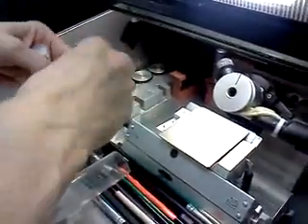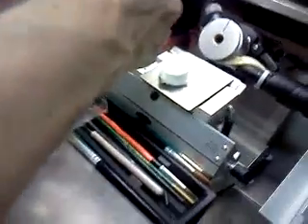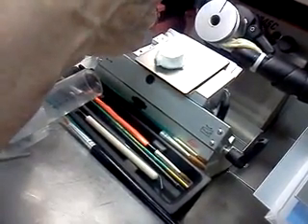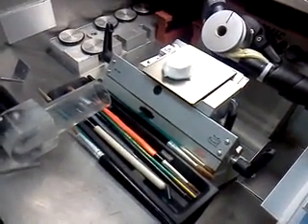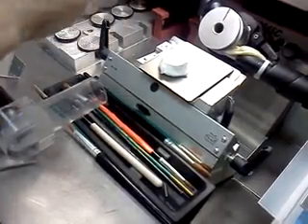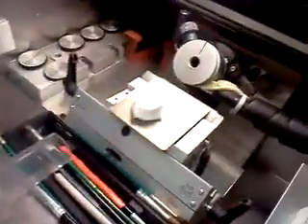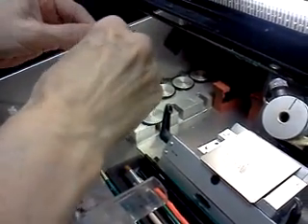Important to wear gloves whenever you... You know, it's cold in here, so I'll leave that up to you. Yes, you might want to wear gloves. I'll probably be putting them on, but in terms of touching that, I need to have them on because I don't really want to get the OCT on me. So, yes, I mean, I don't know that the OCT hurts, but I would suggest it. Now, we're going to save this, and we're going to save this because we want to put it away later, okay? All right.